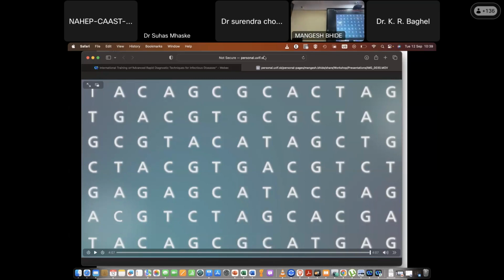Do you remember my first lecture where we had runs and repeats? Runs and repeats means when you have AAAT, AAAT, AAAT. So it happens with such stretches only. When there are 10 or 13 A's, then the polymerase will slip.